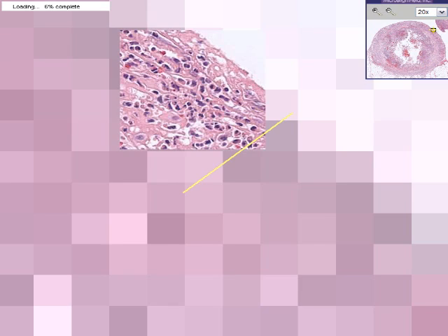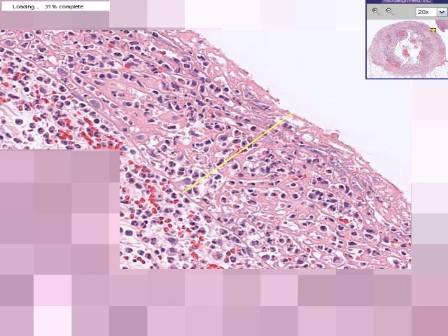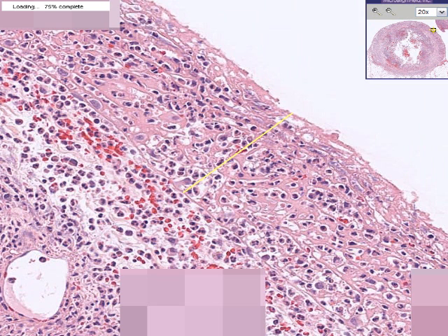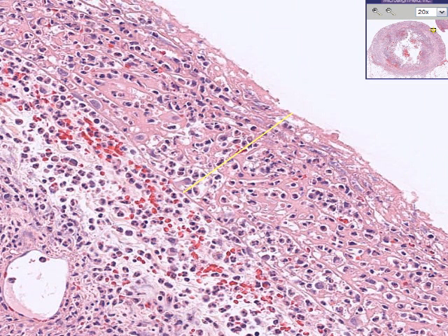Here is an arrow that demonstrates the fibrinopurulent exudate. This was the white, milky, creamy area which looks like it's about 50% fibrin and 50% inflammatory cells.